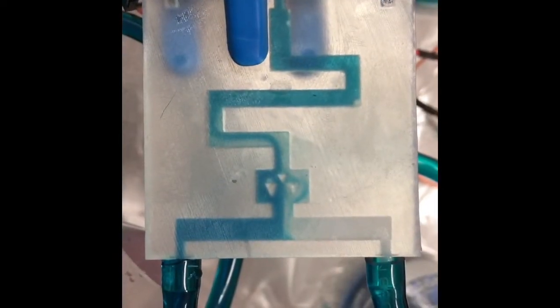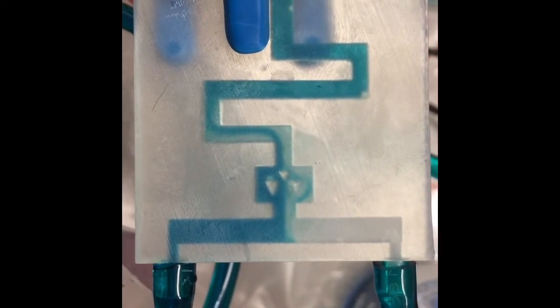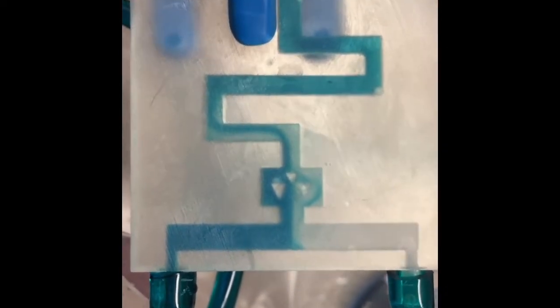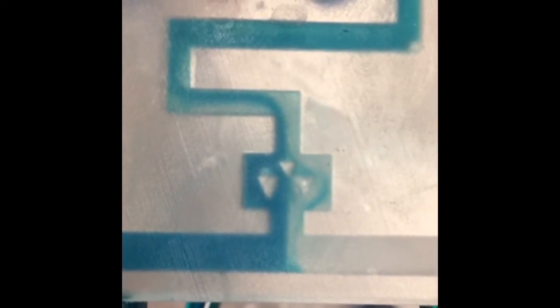The S reactor was the best due to its high promotion of mixing. We once again see a boundary layer form between the two reactants. The first chamber works to break this boundary layer up with baffles. It does a good job, as we can see the sodium hydroxide part of the boundary layer have a blue hue. The boundary layer is still visible, but not as distinguishable right after the chamber. Once the flow begins to hit the turns, the layer vanishes.